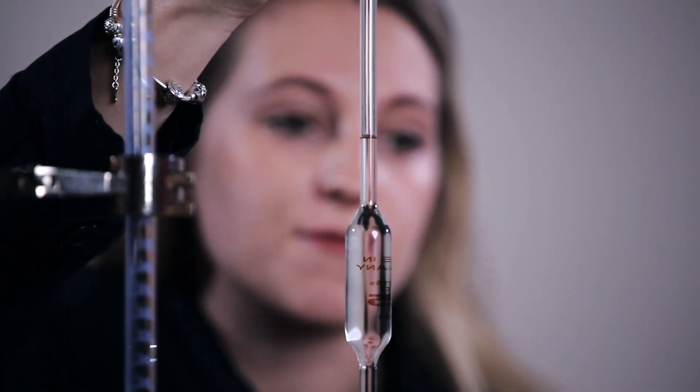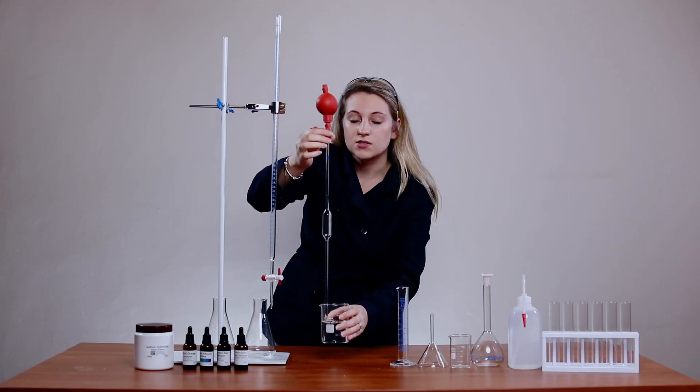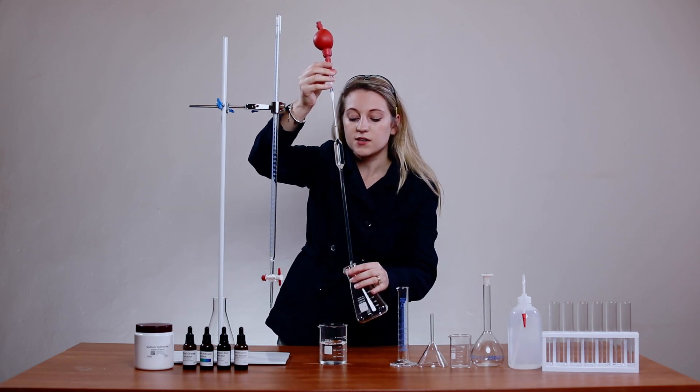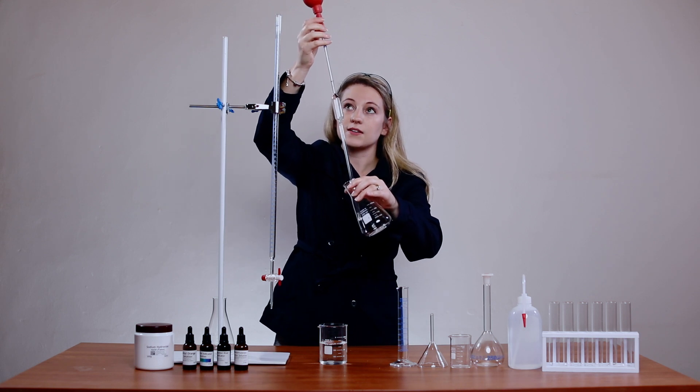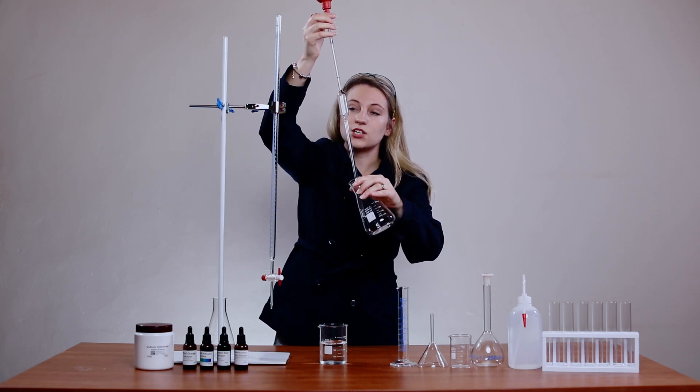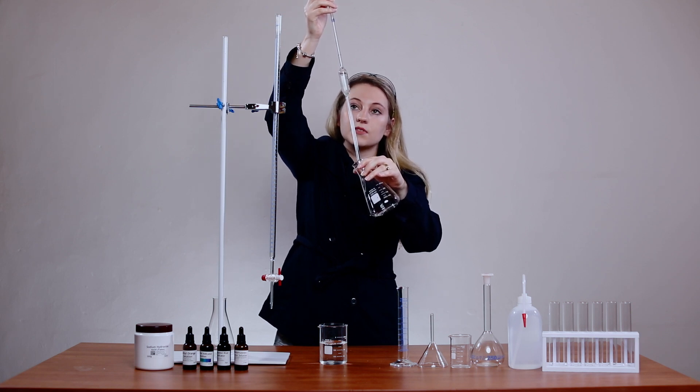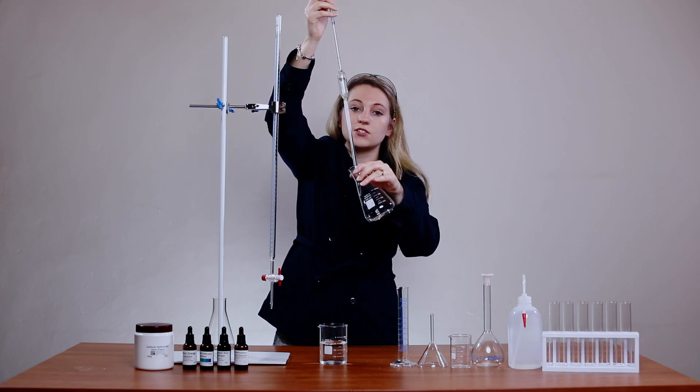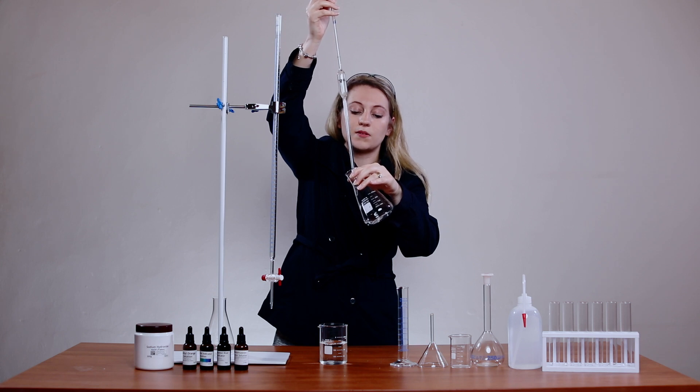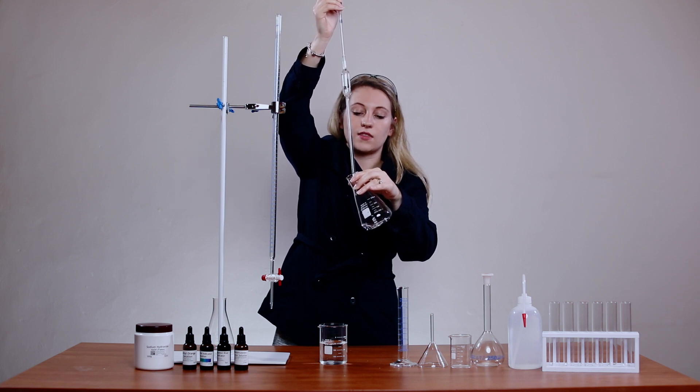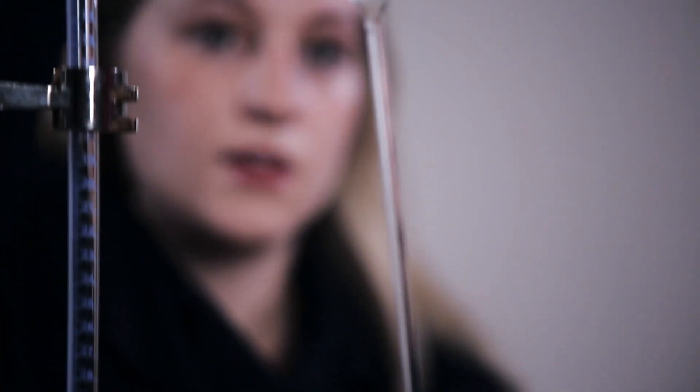Now I'm going to take this solution and put it into my Erlenmeyer flask, tilting this beaker and then pressing the eject button on the red pipette filler. Make sure that you tilt your beaker; this helps so that you literally get that last drop out into your flask. You want all of that liquid to go in there and you want to be as accurate as possible.